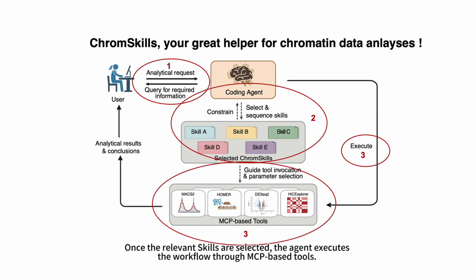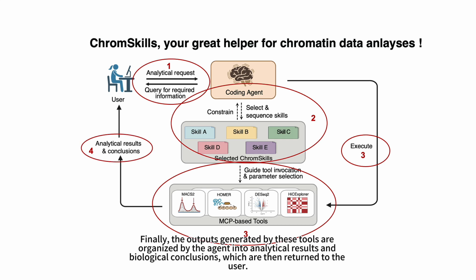Once the relevant skills are selected, the agent executes the workflow through MCP-based tools. Finally, the outputs generated by these tools are organized by the agent into analytical results and biological conclusions, which are then returned to the user.